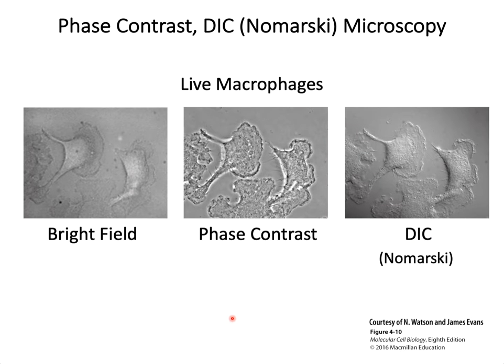Let's compare the images from these microscopes. The first variation is a phase contrast light microscope. As mentioned previously, the medium that the sample is in has a typical refractive index, but all of the different components of the cell have different refractive indices depending on their makeup, so the nucleus has a little bit different refractive index.